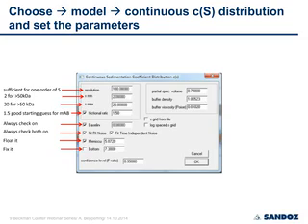The bottom can be fixed because the cell has a fixed geometry and you don't want to fit for the bottom in a velocity experiment, other than in an equilibrium experiment. I also like to set the confidence level for the F statistic ratio at 0.95, two standard deviations, and not 0.68, because this suppresses artificial peaks. And this is what you want to know. You want to know that the peaks you are finding after convergence of the fit are actually real and not fitting artifacts.